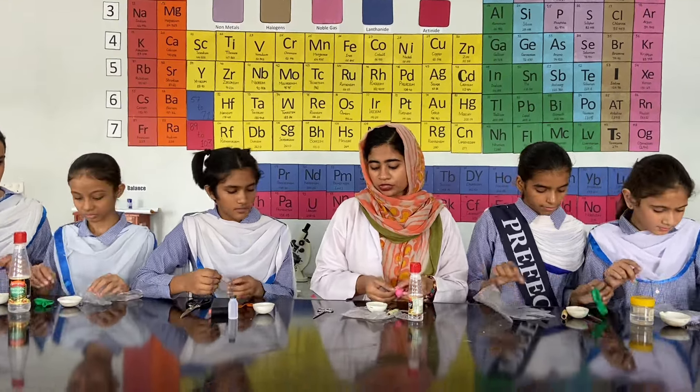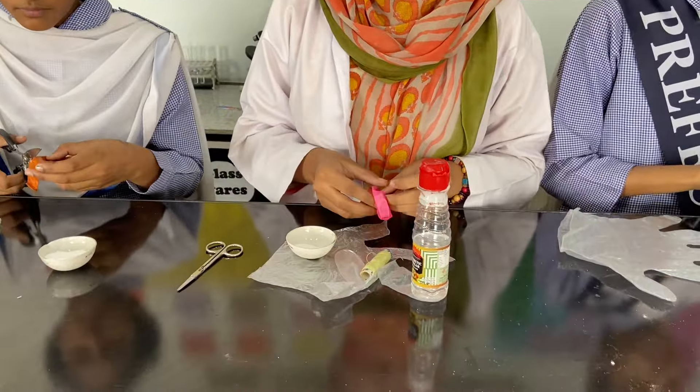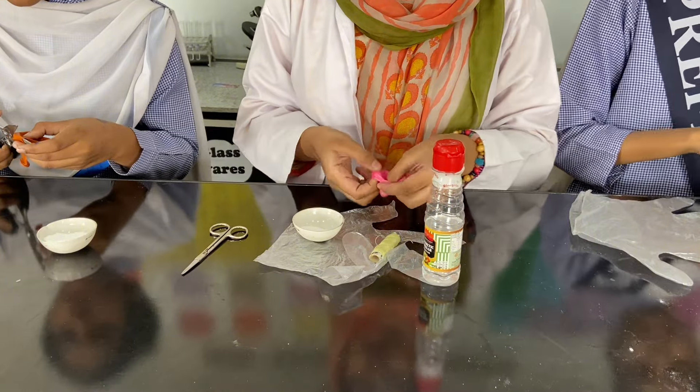At the start, we will take some small amount of baking soda inside the balloon. So let's start doing that.